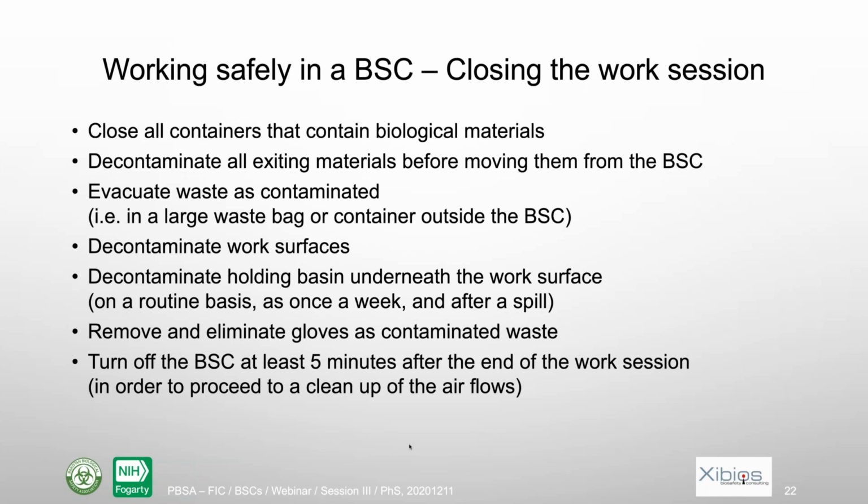Then you should also decontaminate all work surfaces, and that's important for the people who work after you. It's for biosafety, but also for product protection. We should also think of decontaminating the retention and holding basin that is under the work surface, and this is something which is very often forgotten. We need to do that on a routine basis, like once a week or once every 2 weeks, but also if you have a spill. If you have a spill, it's likely that some liquid will go under the work surface and end up there. You should finally remove and eliminate gloves also as contaminated waste.